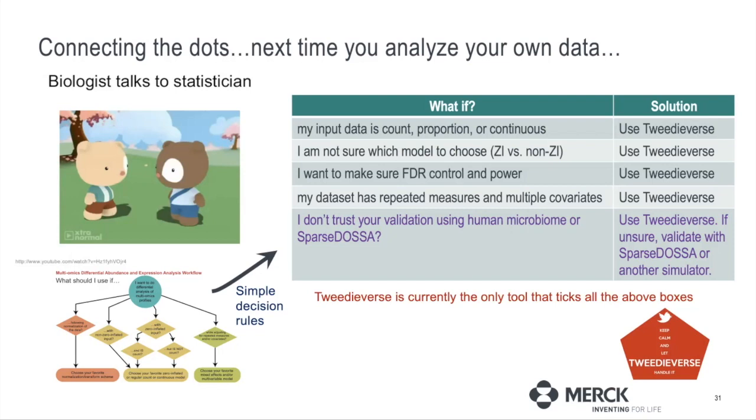But here, you have the opportunity to change the model if you want. There are two models currently, but the goal is to have multiple models for the users. So with that, Tweedieverse is really the only tool, especially when it comes to microbiome multi-omics differential analysis.